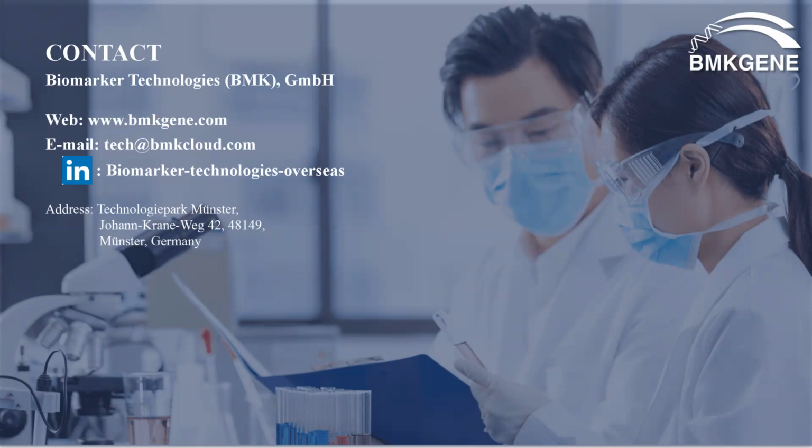And then we do have a video guide to show you how to do the OCT embedding, because for me it's very straightforward. It's mainly on the cassette. We put the OCT medium in, and then we position the tissue in the right position while it's cold, and we can freeze the OCT block in liquid nitrogen with isopentane, so it keeps a very perfect structure.